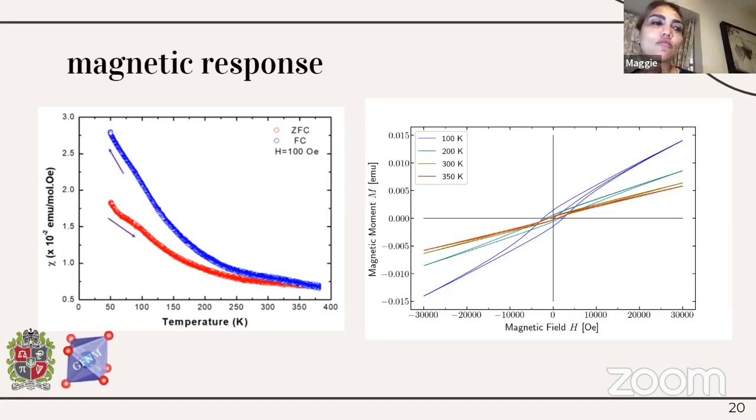Y una sugerencia, no sé si les puede servir hacer estudios de AFM con la punta magnética. O sea, hay estudios de microscopía de fuerza atómica donde puedes poner una punta magnética y te mapea los dominios. Entonces vas a diferenciar entre los dominios que son magnéticos y los que no lo son a nivel nano. Entonces, eso les podría ayudar.